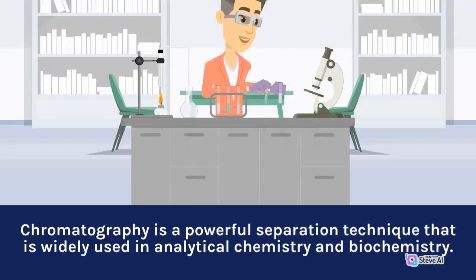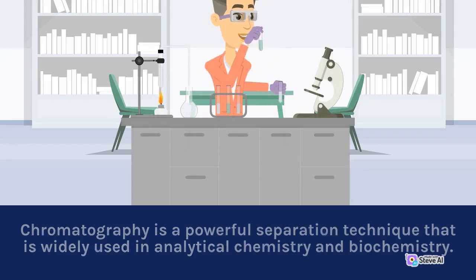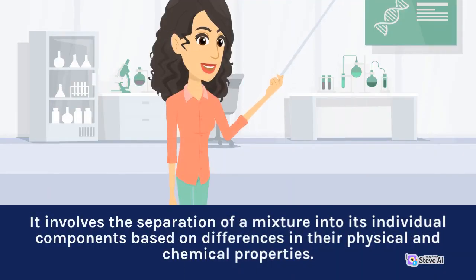Chromatography is a powerful separation technique that is widely used in analytical chemistry and biochemistry. It involves the separation of a mixture into its individual components based on differences in their physical and chemical properties.